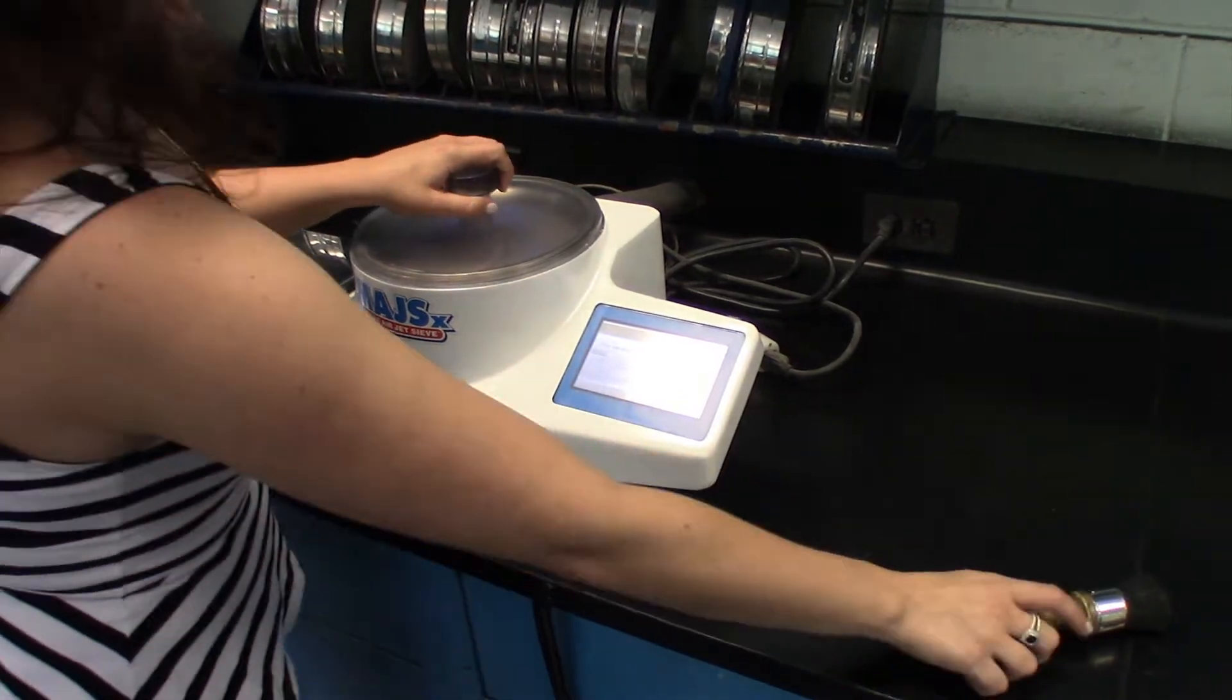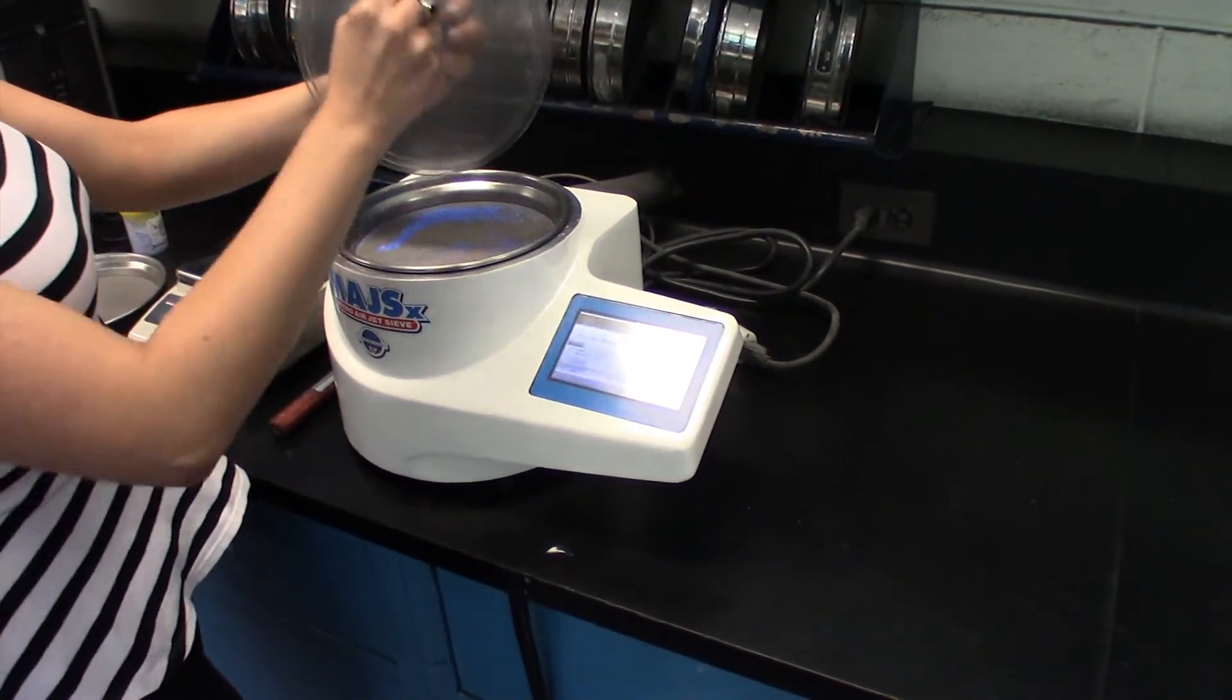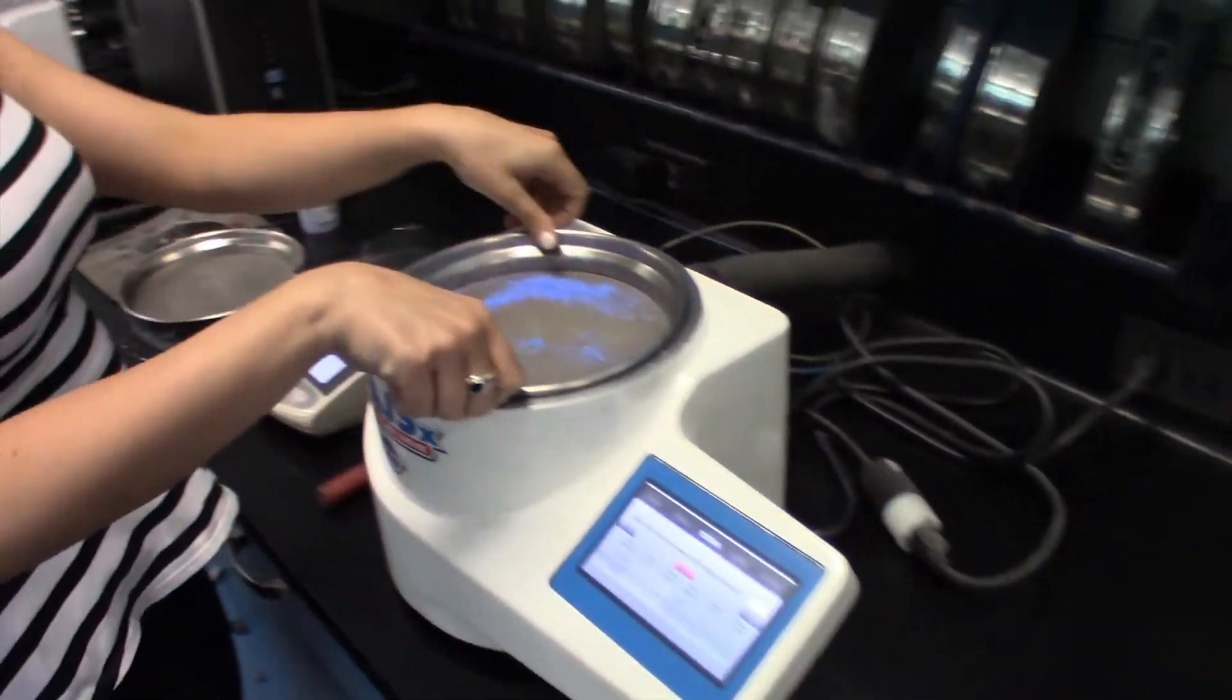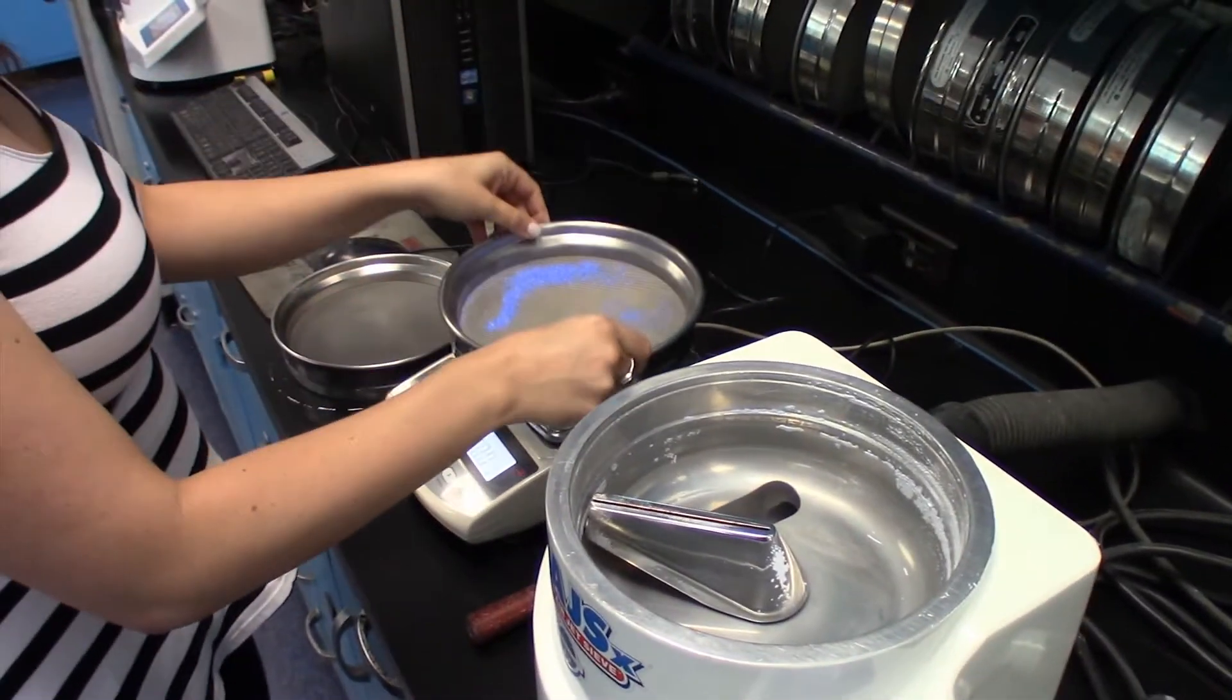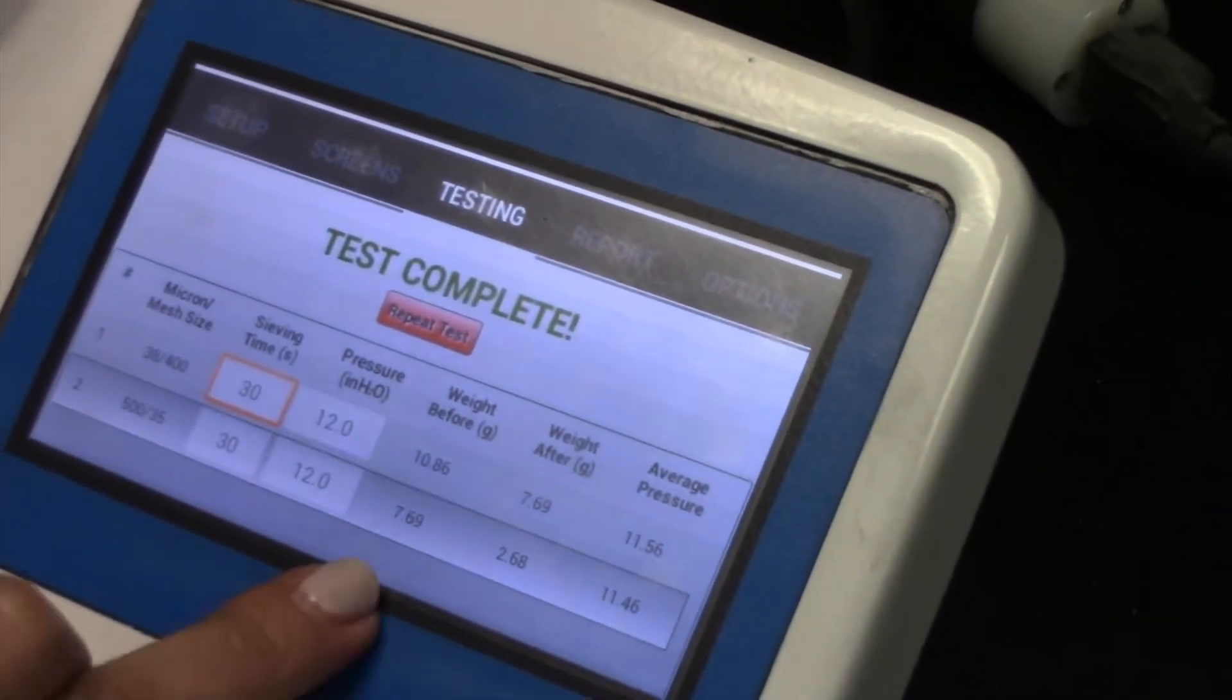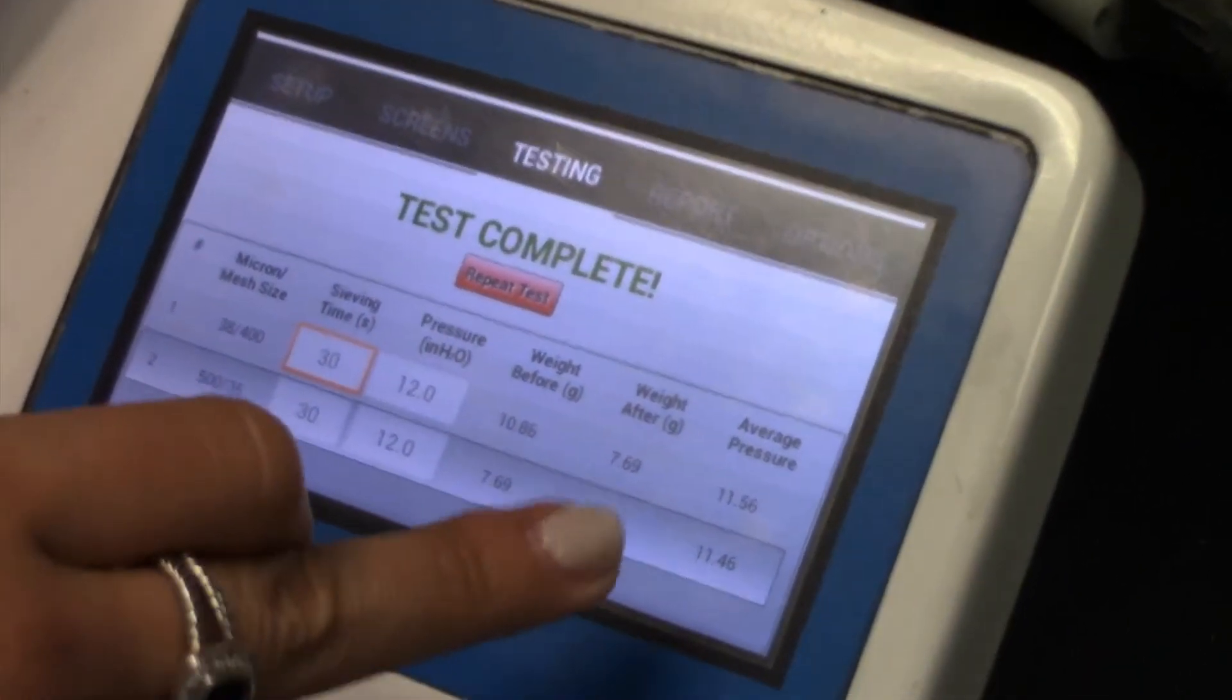We will press next, remove any material that got stuck to the lid, and we'll weigh the sieve screen with the retained sample. Next. So now our test is complete. You can see here the weight before and the weight after.